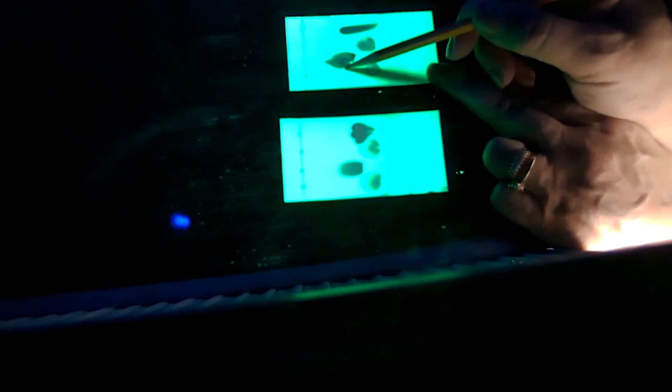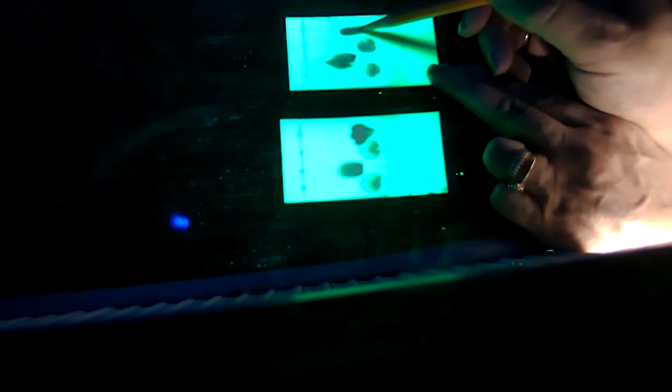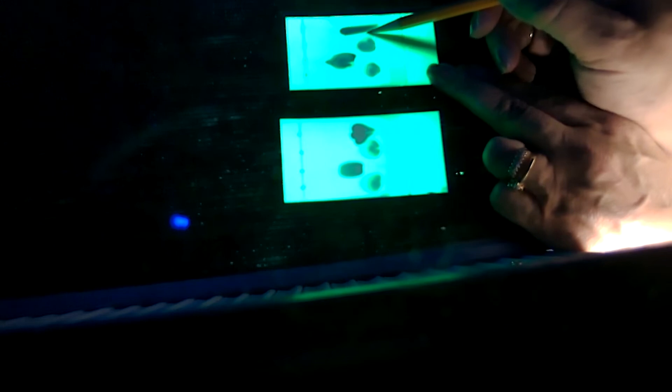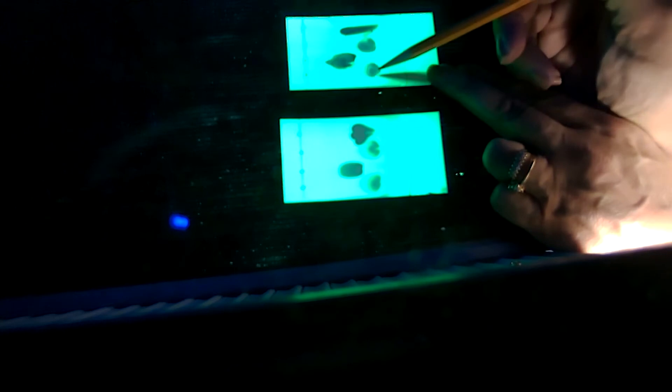And as long as you're consistent in measurement you should be fine. But what I do, I circle the darkest spot, and then I measure from the center of the dark spot to the baseline. Center of the dark spot to the baseline. Same thing here, center to the baseline.